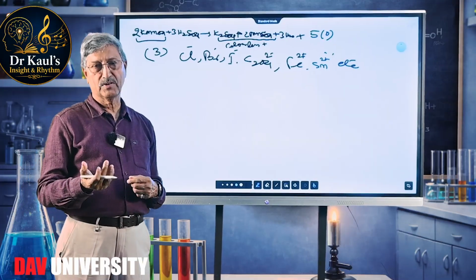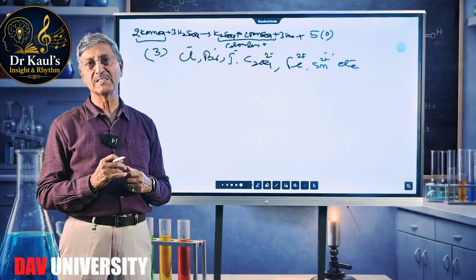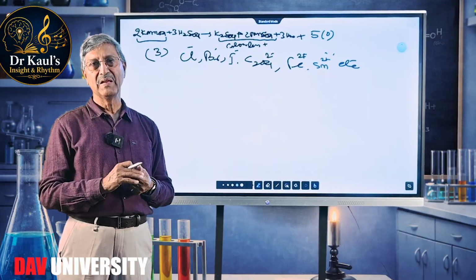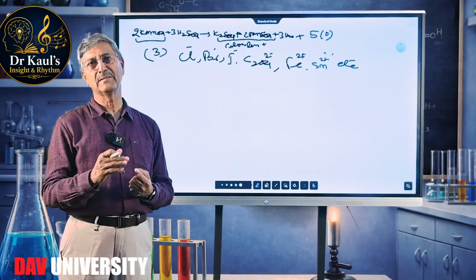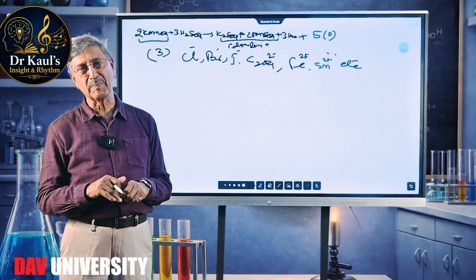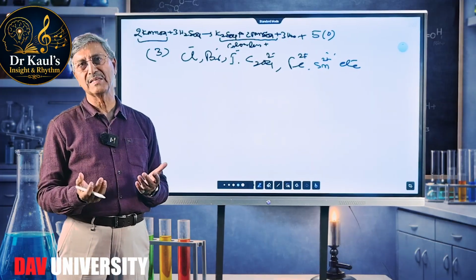Now in our subsequent discussions, we'll be discussing the concentrated H2SO4 test as a preliminary test, and the radicals which are detected by concentrated H2SO4 will be confirmed by confirmatory tests. And then of course there are certain radicals which are detected neither by dilute sulfuric acid test nor by concentrated H2SO4 test. They are detected and confirmed with individual tests.